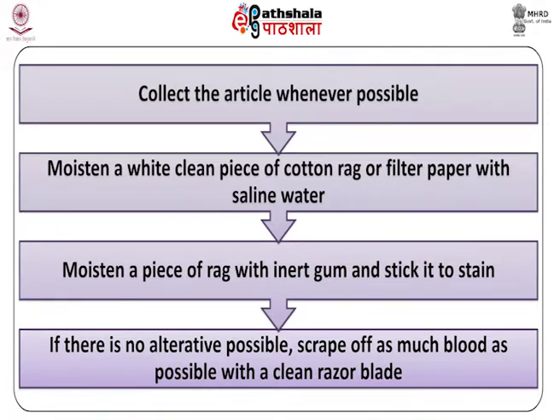Moisten a piece of rag with inert gum and stick it to the stain. The stain adheres strongly to the surface. Peel off the piece when it is dry. The stain is transferred to the piece. Dry it and pack it as usual.